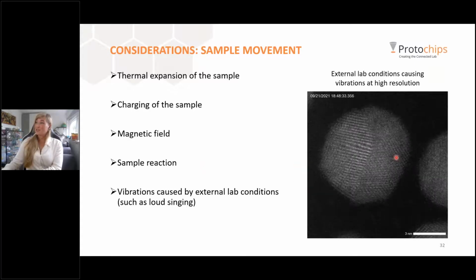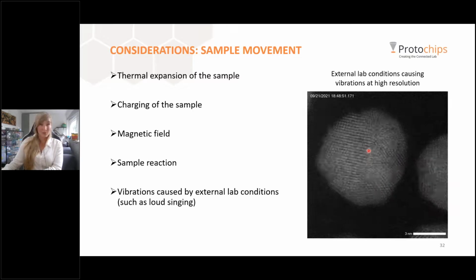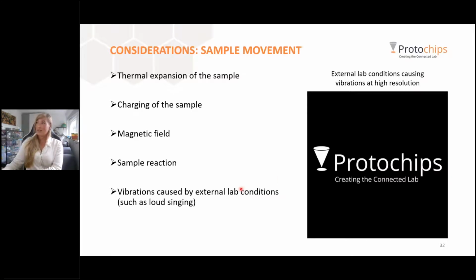So she started to sing, and you can see immediately that these kind of vibrations have a huge impact on your atomic resolution imaging. So external vibrations, walking in heels is never a good idea around the microscope, or please don't sing to your microscope either.